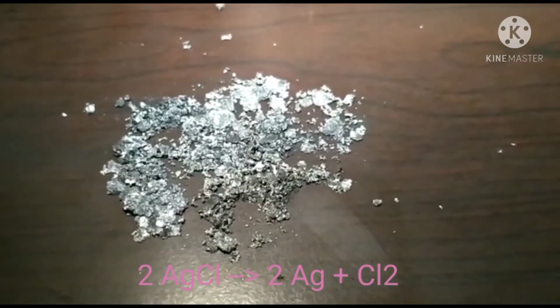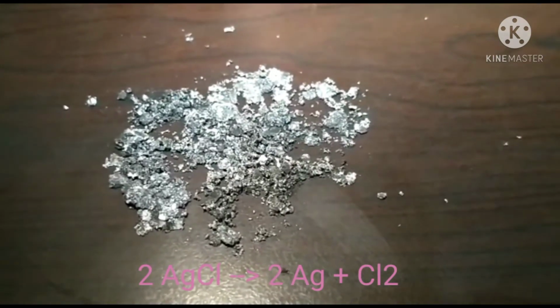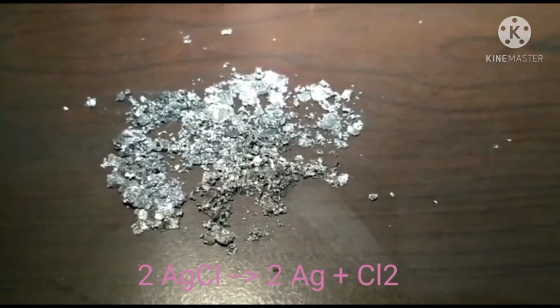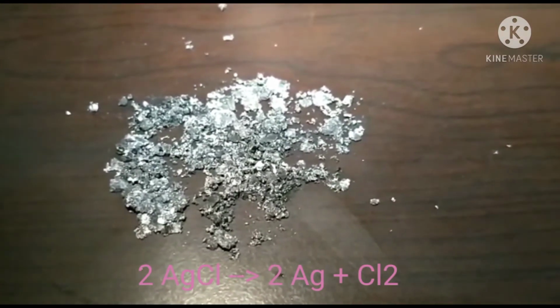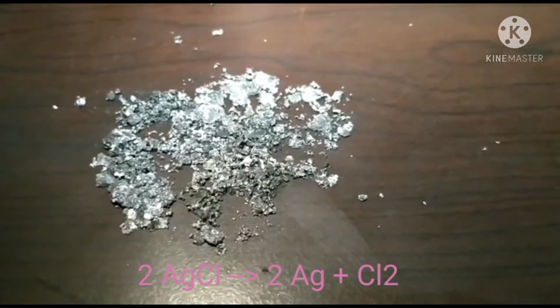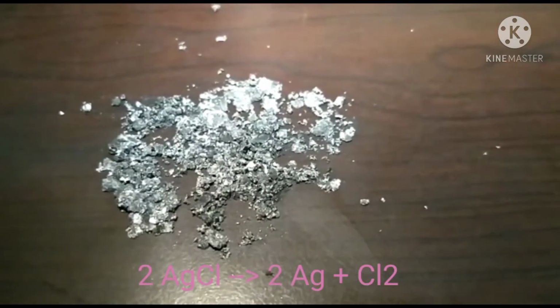observe that this mixture will turn grayish. It will take some time, but it will turn grayish. After some time you can easily see that this silver chloride has turned grayish. How? The light source which we are using causes photolytic decomposition, causing AgCl to separate and form pure silver metal, along with the evolution of chlorine gas, and the mixture turns grayish.